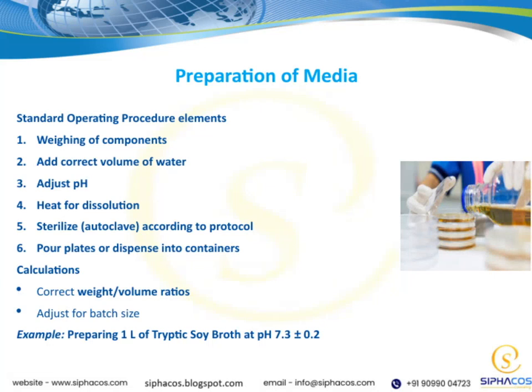Let's walk through the key steps involved in preparing media, starting with the elements of the standard operating procedure. First, we need to carefully weigh each of the components to ensure accuracy. Next, we add the correct volume of water, making sure it's precise to achieve the desired concentration. Then, we adjust the pH to the target level, which is crucial for supporting microbial growth. After that, we heat the mixture to promote dissolution of the components.